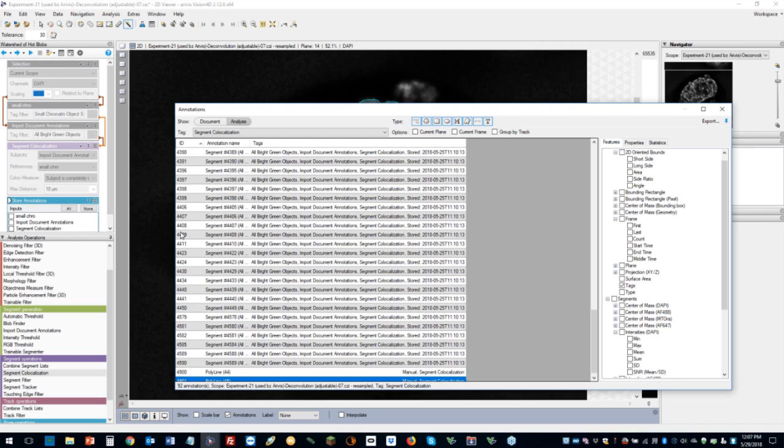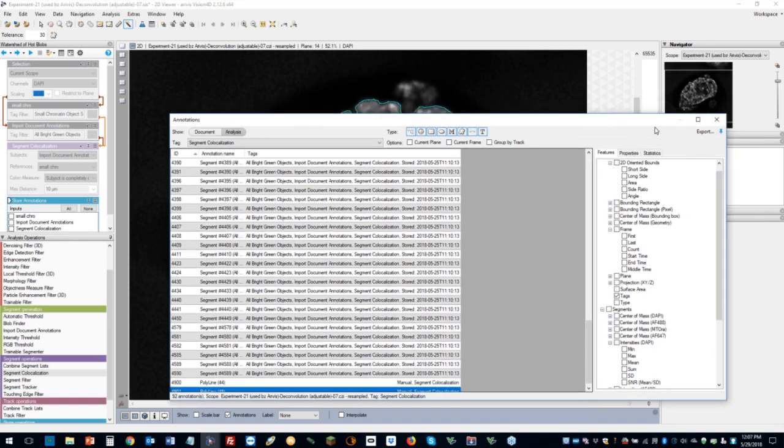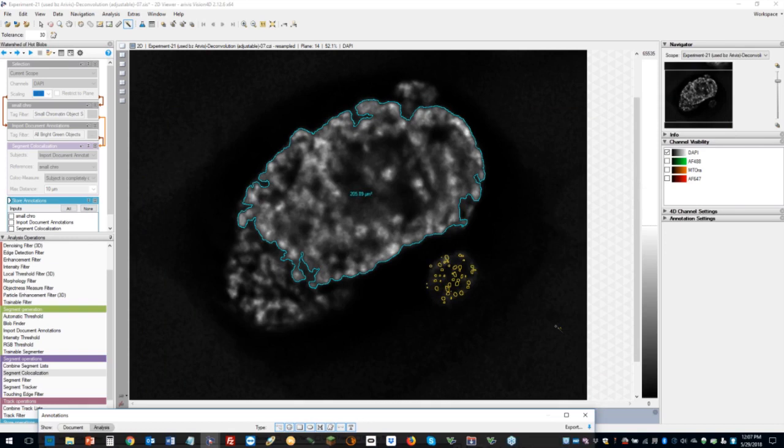Okay. And a question here from Kathleen. Have you done any analysis on non-fluorescent, non-SEM data, such as differential interference contrast microscopy? I have recently done so, yes, the answer is yes. We've looked outside of fluorescence. The tools in Vision 4D are very comfortable for working with fluorescence images. I think we make it pretty easy.